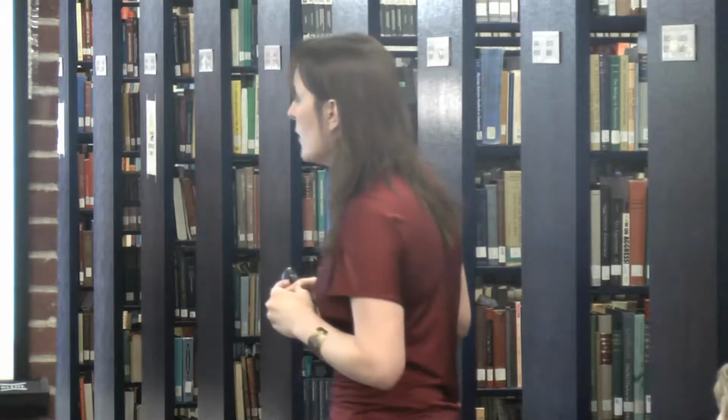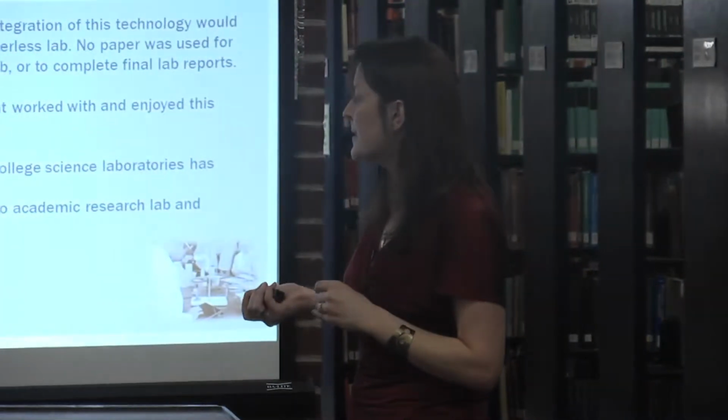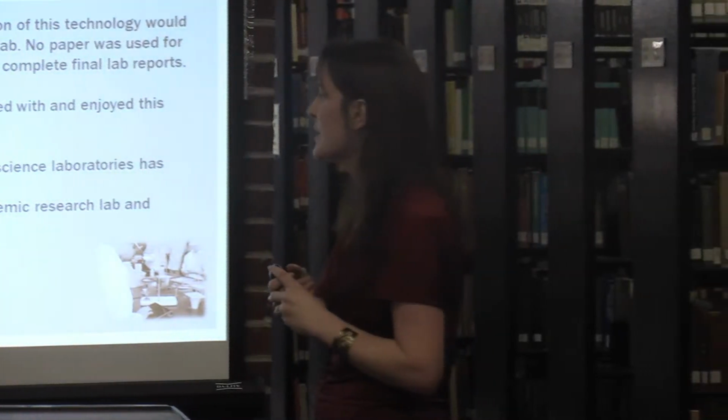Some of them were for the laptop to come into the lab, some of them were for the laptop to stay outside the lab, and then the researcher would go out and write in there. But laptops can be a little cumbersome when you're trying to work around a lab. Recently, there have been some iPad apps that I came across that are for that use. The problem with them is they're really created for a commercial type of experience. So they're linked to inventory, and they're linked to certain enzymes. They're really biologically based. So they really were for a commercial type of use.